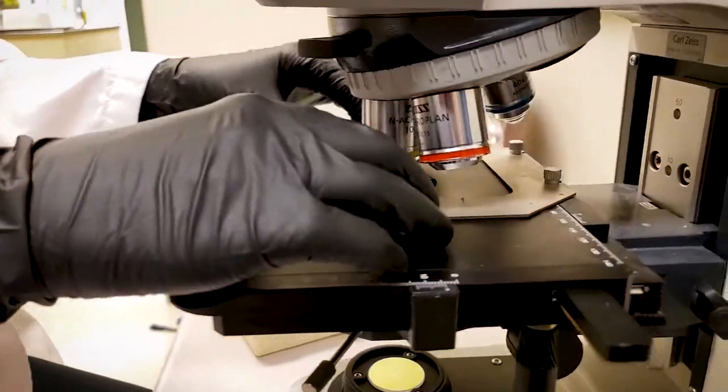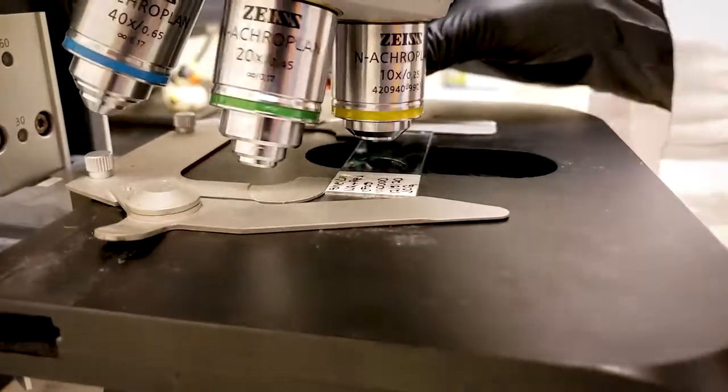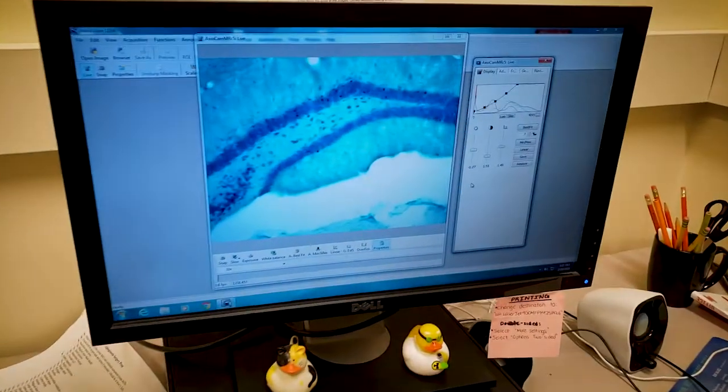Here in the Rhodes Lab, we have three light microscopes. These allow us to image tissue at various magnifications so that we can quantify cell numbers and areas of different brain regions.